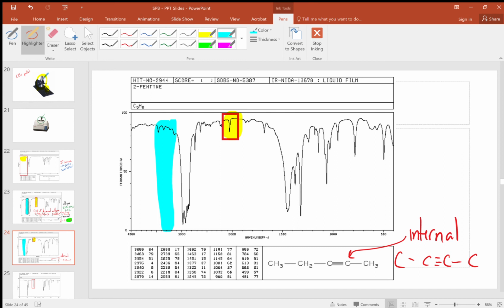Finally, to sort of close out this region in the range of 3,000, one other peak that we want to talk about. So you may have noticed, and if you haven't, you can go back and look at some of the other spectra, that pretty much every spectrum that we've looked at, plus every one that we're going to look at beyond this, has some peaks at 2,900 to about 3,050.